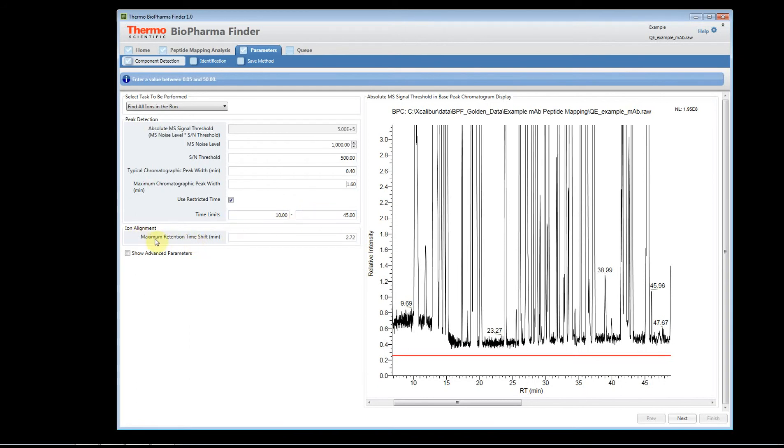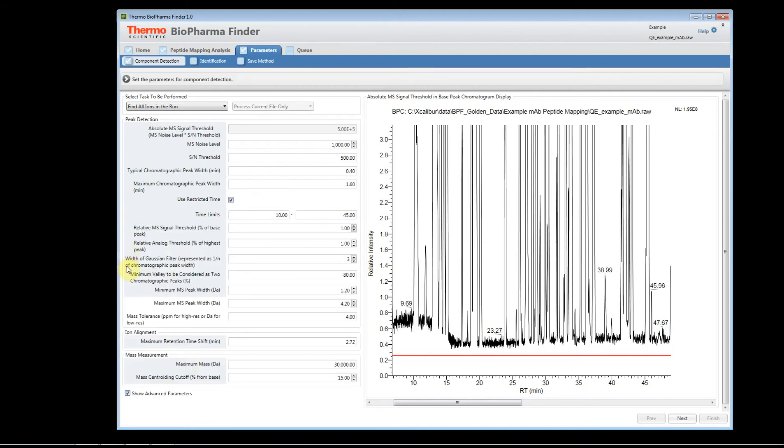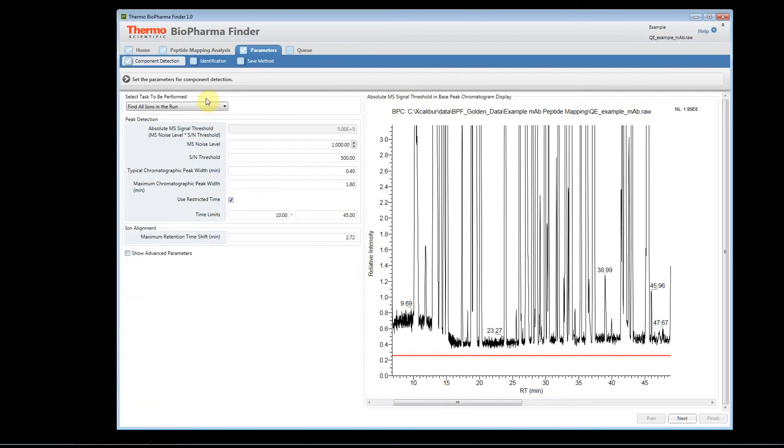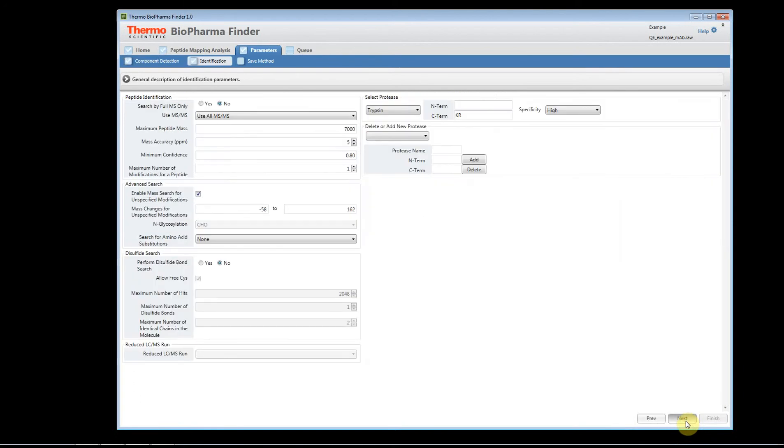We have chromatographic, we have ion alignment. When you have multiple files, it will perform ion alignment. We have some advanced parameters that we kind of hide now that you really don't need to adjust. We find that only in very special cases do you ever need to adjust these parameters. That's the component detection. You can click up here to go to the identification, or you can click on the next button, and it will take you to the tab. Here, you have your identification parameters, and this is broken up into several different sections.